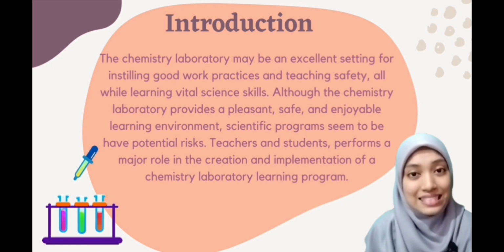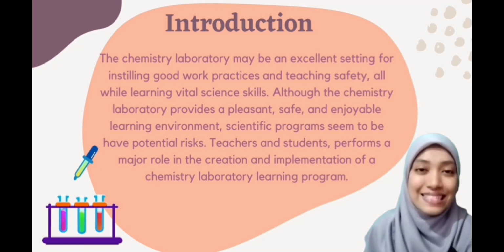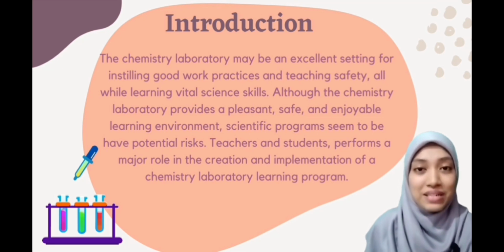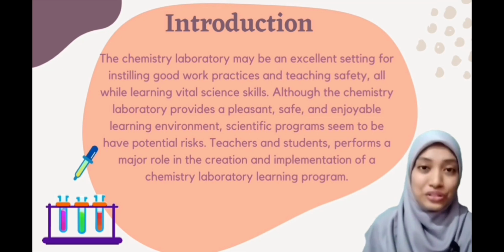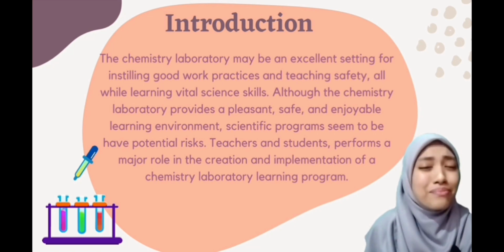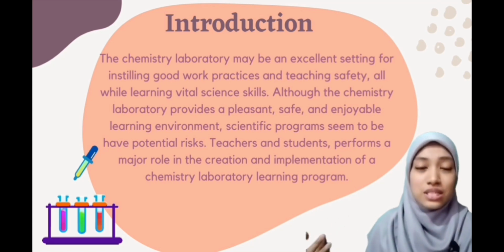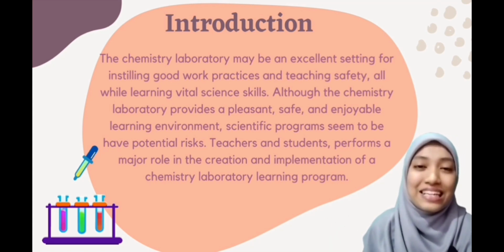So, as a result, it is important for everyone to be aware of and understand their respective responsibilities as well as what to conduct when in the laboratory. And of course, students must be taught about what might go wrong, how to avoid such situations, and what to do in the event of an emergency.